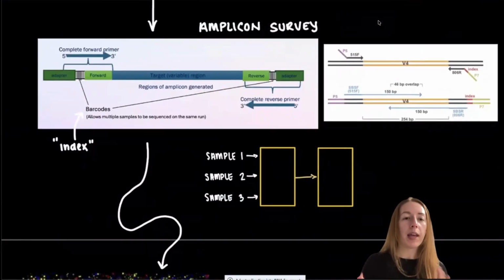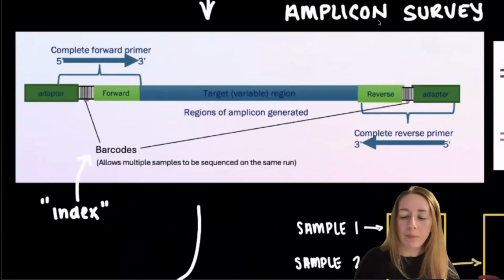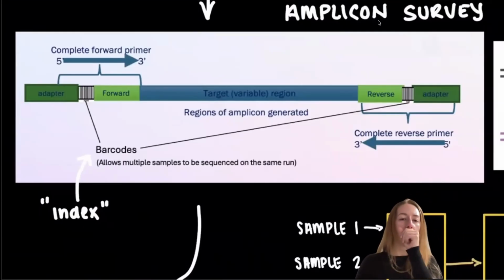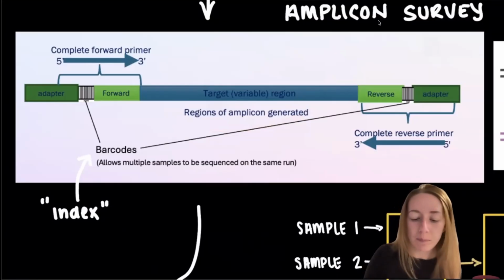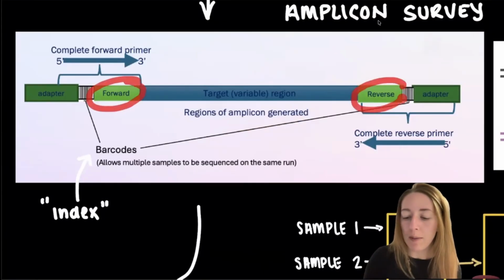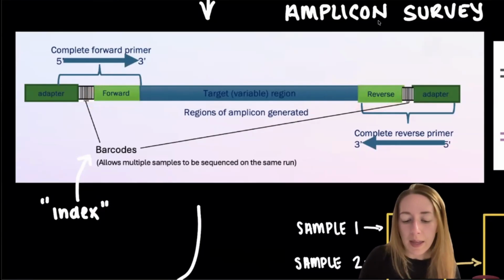Now we're off to amplifying our sequence. So we want to make sure we design our amplicon appropriately. These are just some of the basic components that most amplicons will have. We have our target region. This is going to be whatever you decide, depending on your primers, which regions you decide to use in a 16S gene. And then, yeah, those will be your respective primers.